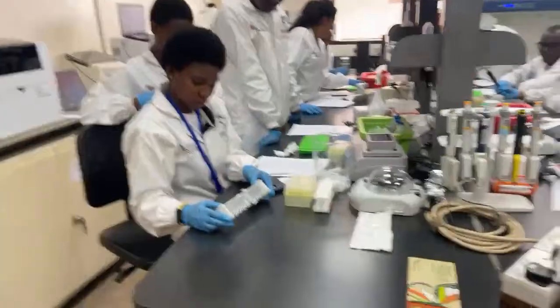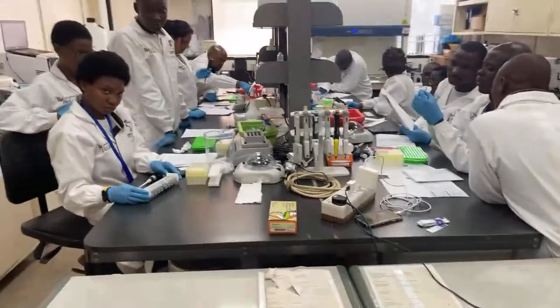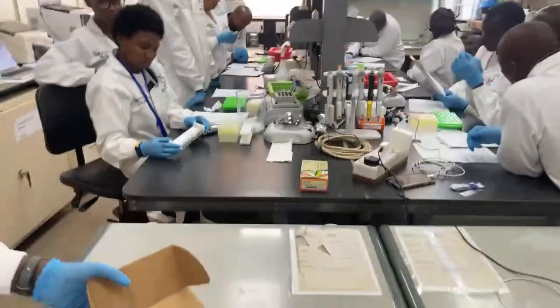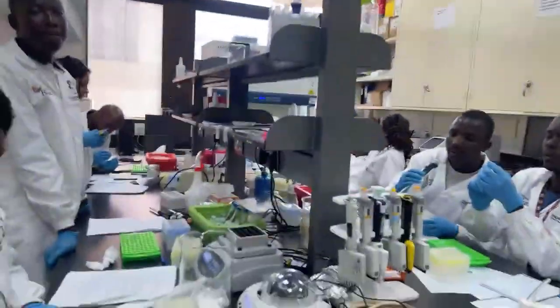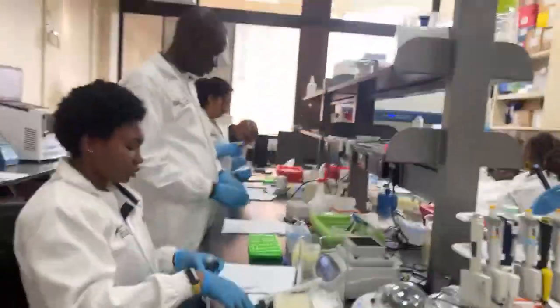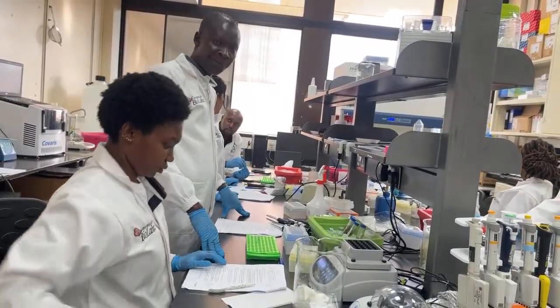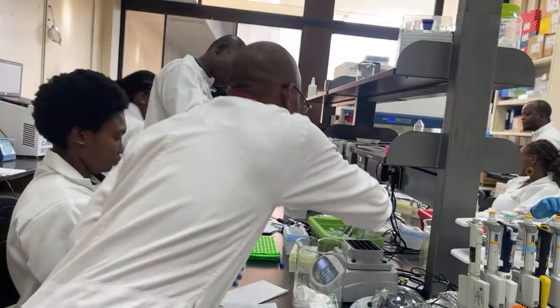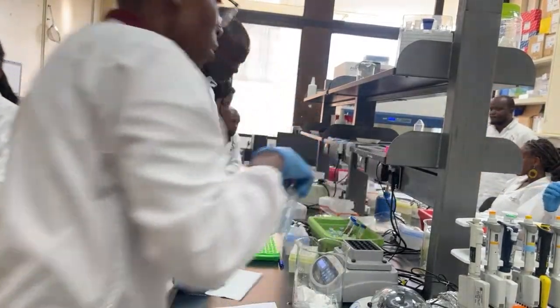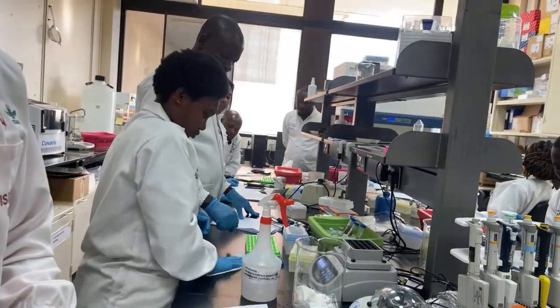You set your time? Is there a minimum on the time? Previously everyone can set it. 10 minutes. Oh, it's 10 minutes. Are we missing anything else? Let me go around. I don't think we are. I think everything is fine. This one goes into the -20 kit, the plastic. This also goes into -20 with that other isopropanol.